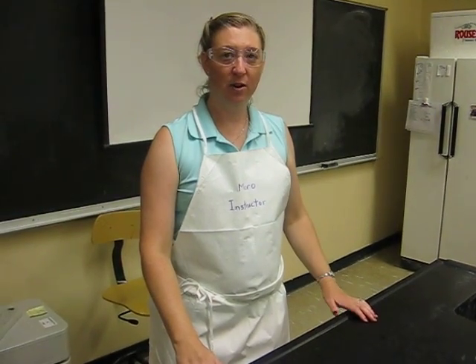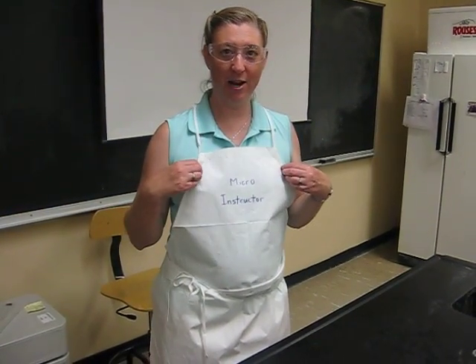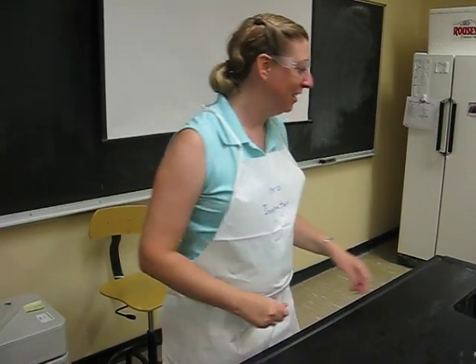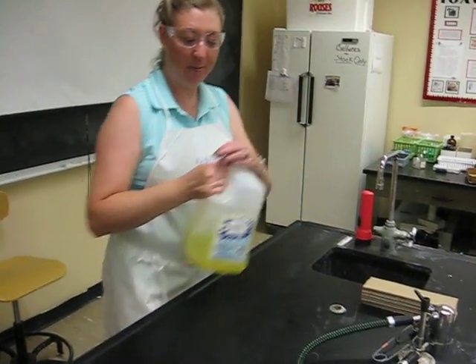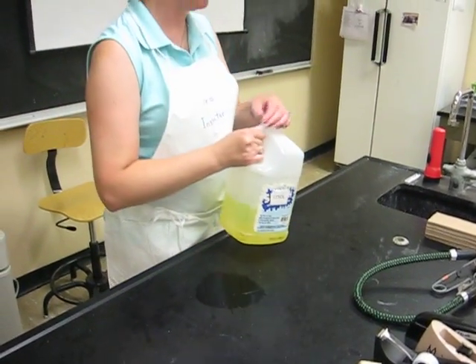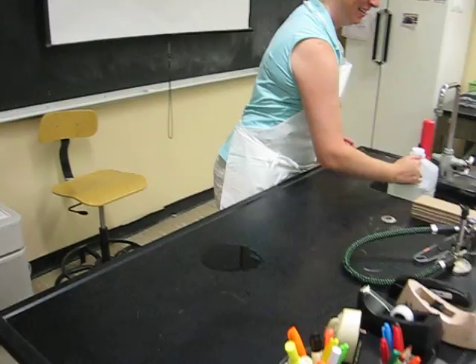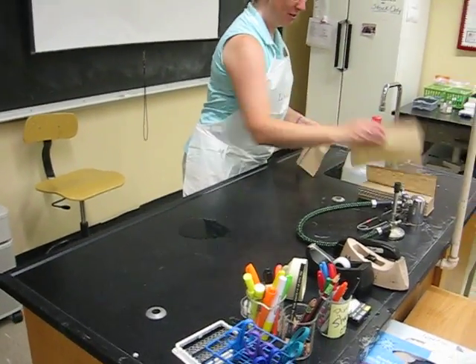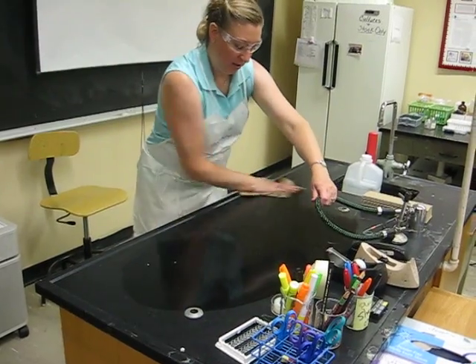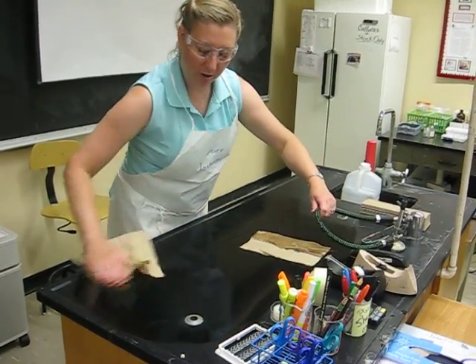Aseptic Transfers Lab. I've got my apron on, tied on the side, and my safety glasses on. I'm going to disinfect my lab bench by pouring some Lysol on it — hopefully we'll have spray bottles soon. I'll use my paper towels to disinfect my workspace.